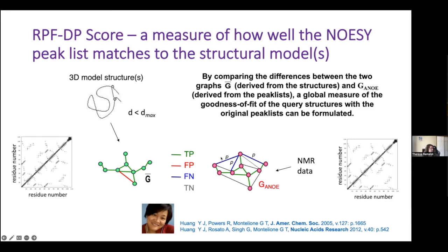For example, some NOE might have several different assignments, and you have a certain match tolerance, so you get this ambiguous NOE network. And then you can also show it as a contact plot, where you have the residue and the contacts that you would expect to see from the structure. This is a contact plot, but it would be an ambiguous contact plot.